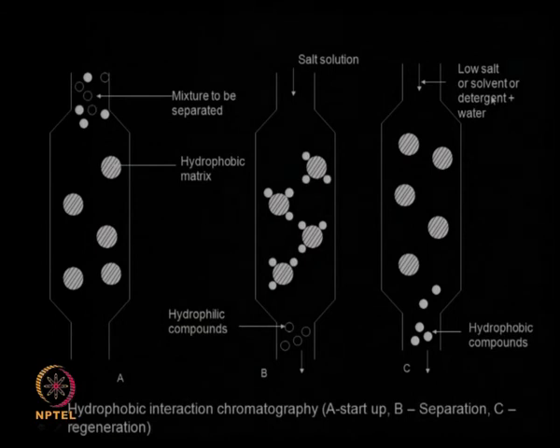Then we can change the salt concentration, or we can add detergent and so on. So whatever proteins that got attached or bound will get released. This is what hydrophobic interaction chromatography is all about. Now we will look at this in more detail in the next class.